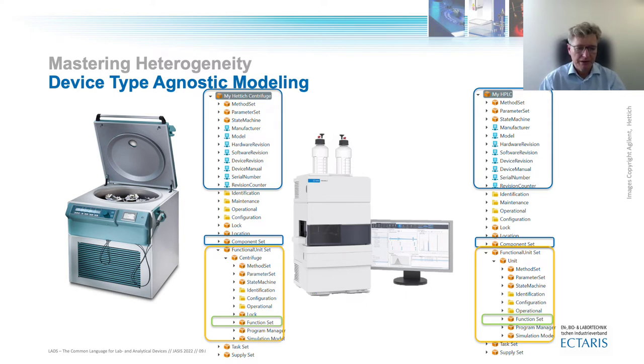And last but not least, the program manager, the magenta box, allows device orchestration and is identical for both device types. Bottom line, over the network, the instruments look pretty much the same. LADS enables plug-and-play interoperability for lab and analytical devices through the device type agnostic modeling principle.